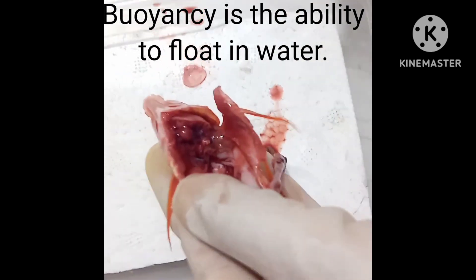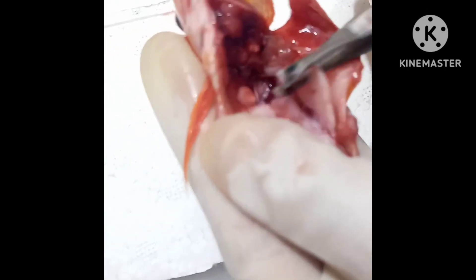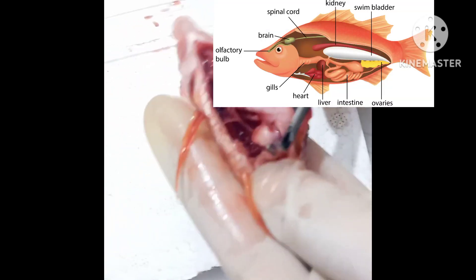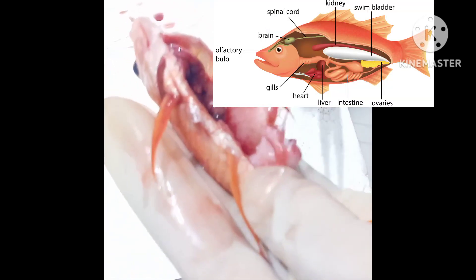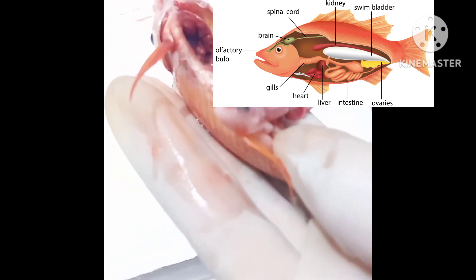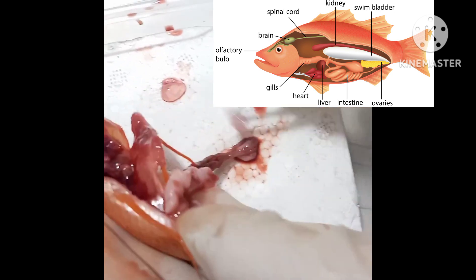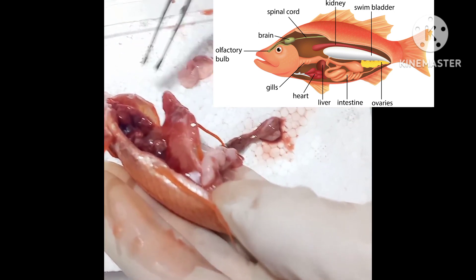Here as you can see, this is the stomach and the intestines. The stomach is used to digest the food, while the intestine helps to absorb the food.